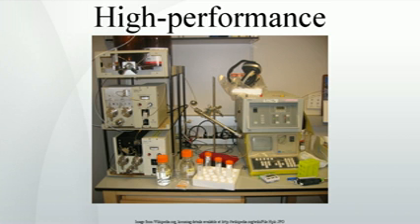Resolution equations relate the three factors such that high efficiency and separation factors improve the resolution of component peaks in an HPLC separation. Internal diameter. The internal diameter, ID, of an HPLC column is an important parameter that influences the detection sensitivity and separation selectivity in gradient elution. It also determines the quantity of analyte that can be loaded onto the column.